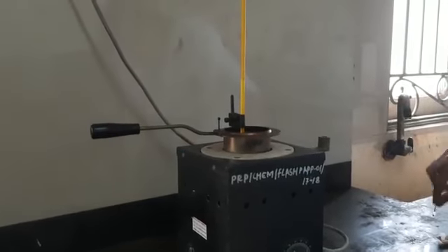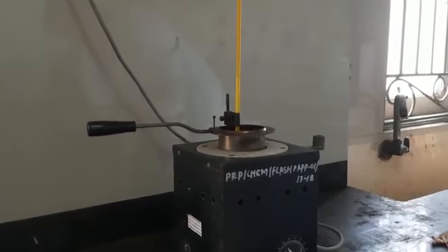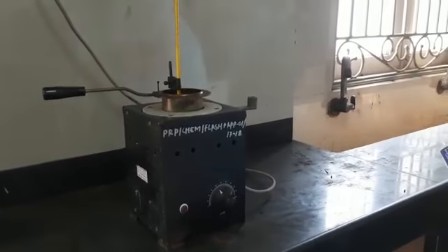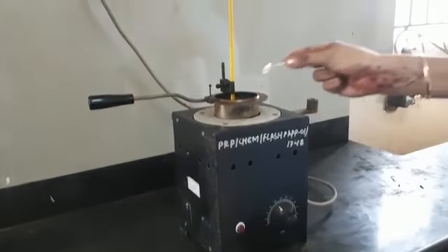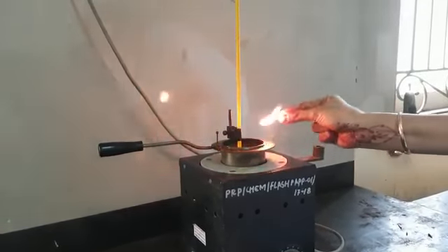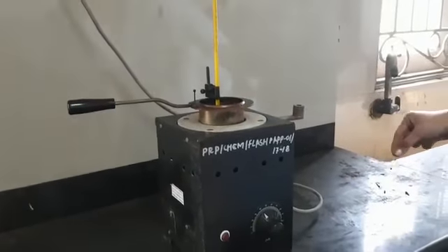No sufficient vapors, no flash. So at 60 degrees, no flash, no fire, no sufficient vapors.